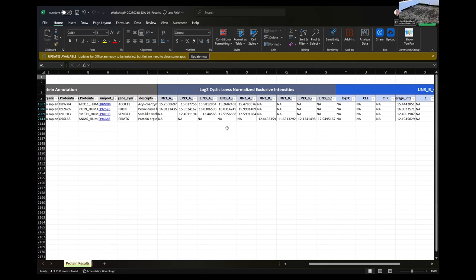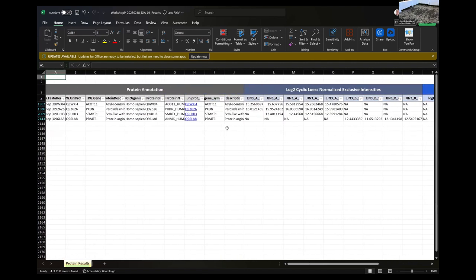And so that would be a way to sort your data and quickly look at those. Now, I'm looking at these proteins and this is not my biology, I don't know, whatever, but you might look at those and go, oh, those are exactly the ones I'm looking for. And that would be a great value to you. So we try to provide you with some tools here where, from the samples that you sent us, you can get to the place where you can make biological decisions.